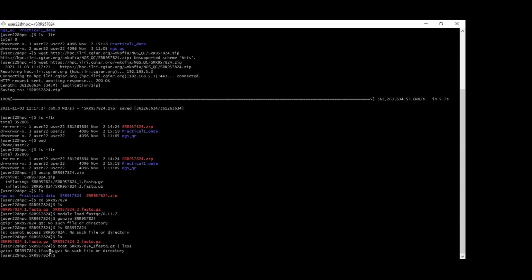So at the end here there is a bracketed end. I don't know what it means. Press Q. Is it a capital Q or small q? Capital Q. Okay. This is where I ended, I think.